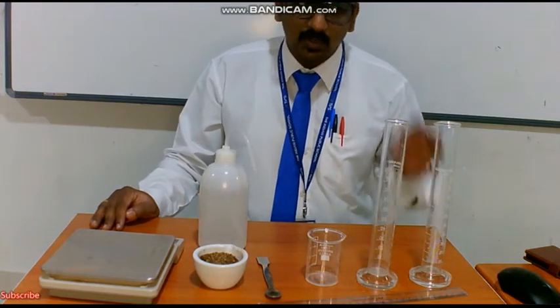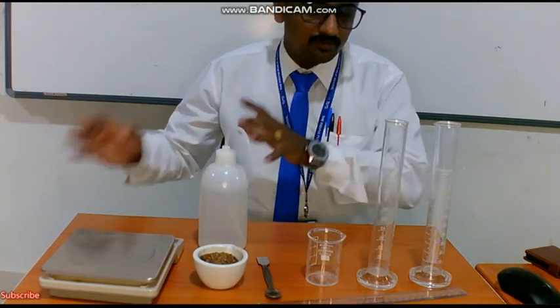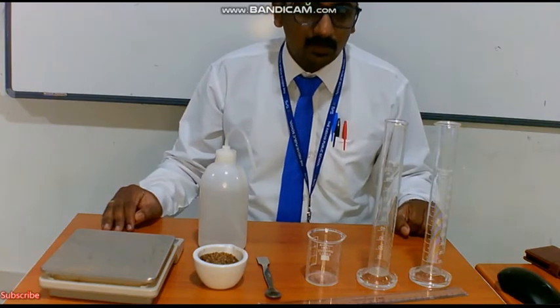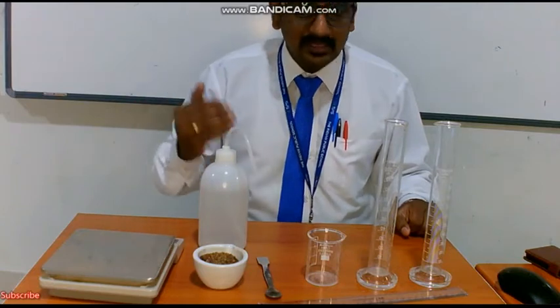Among them, this is the first practical which I am going to handle for you all, in the water profiling test. What is this test based upon? In this, we are going to see the soil texture.